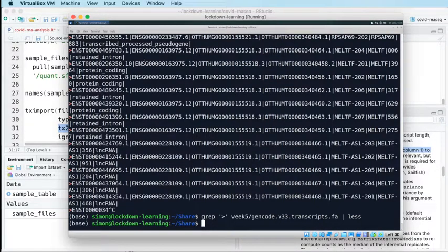So then you can stick those 2 files together into one single file, and I'll show you a trick for doing that as well. So we're gonna need to run 3 commands here: one to extract the Ensembl transcript IDs, one to extract the Ensembl Gene IDs, and then a third command to stick those identifiers together into a single file.